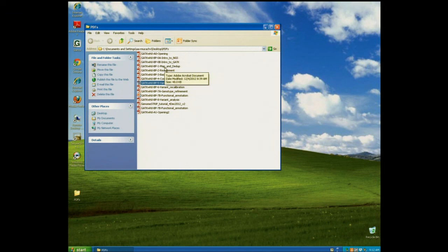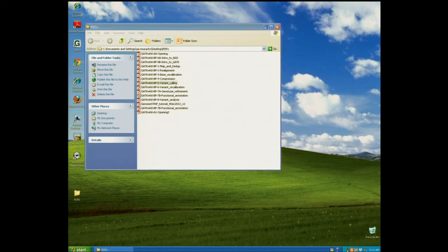Now that you have your BAM, now that you have your recalibrated reads, your correct base qualities, what do you do with them? The main objective in most analyses that we do is to detect genetic variations. So if I have a set of samples, what mutations and what genetic variations do these samples have in the context of my research of interest? This is what we're going to be covering today.